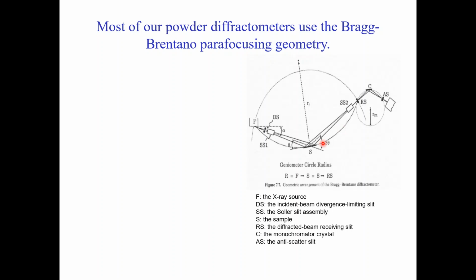Here you can see the different parts, and it's something like a sketch of the experimental process, when we run samples in the diffractometer.